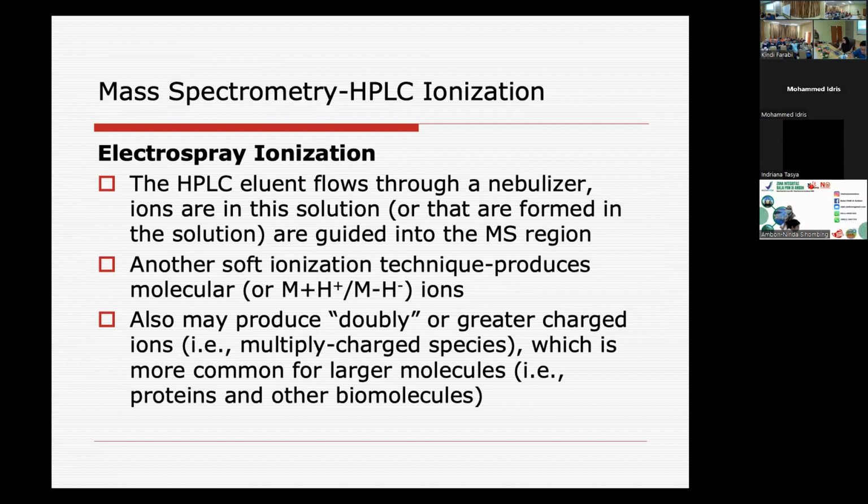Kita menggunakan HPLC eluent yang dialirkan melalui nebulizer ion. Jadi molekul ionnya bisa M plus H atau M min H ion.